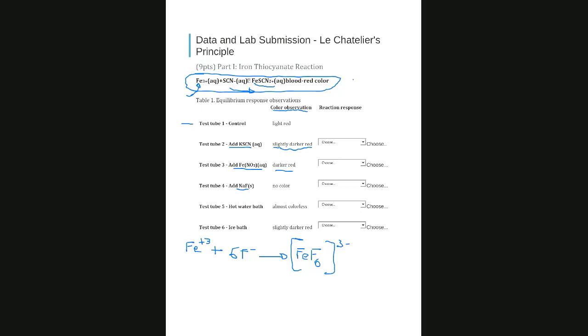So basically, it's removing the iron from participating in making this complex.